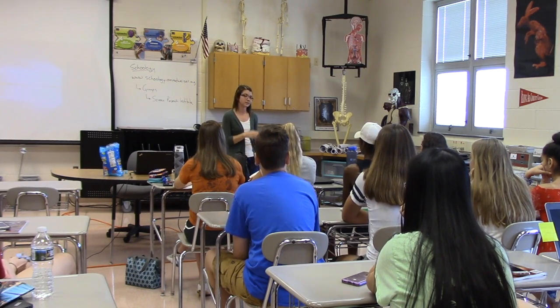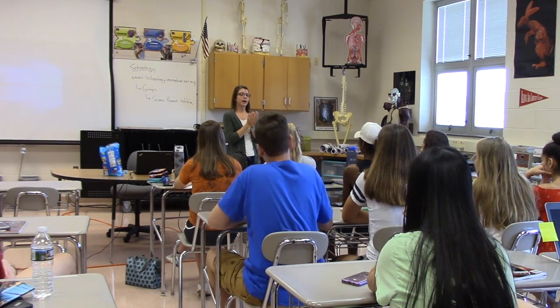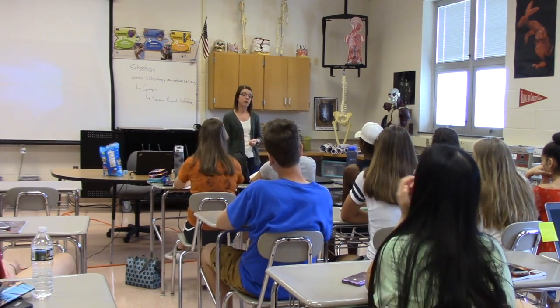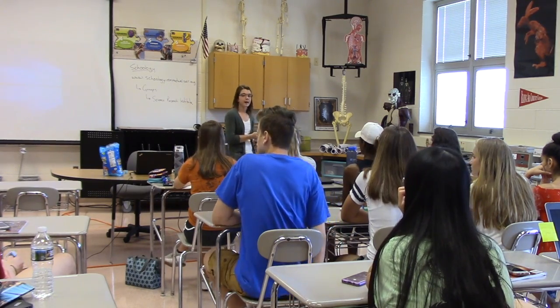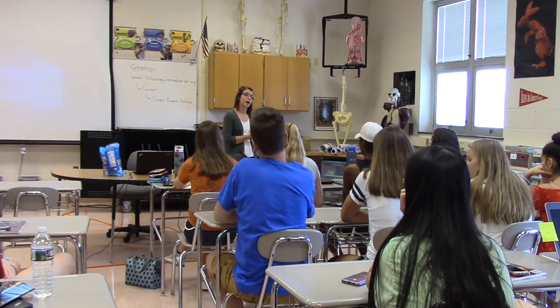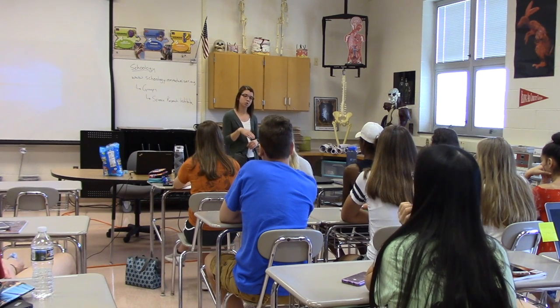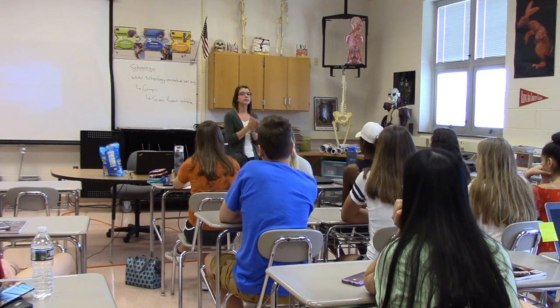So what I would do is take that antibody or antigen or growth factor, whatever's being exposed on the cell surface, and I would bind that to a 96 well plate. And then I would take my client's drug and put it on the plate that's already been coated. And we can measure, and once again diluting that, so we have different dilutions, and we're able to measure what's the best dilution of drug to use on those samples.